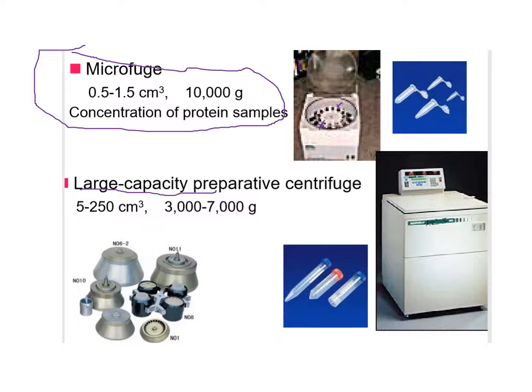This is a 1550, and there's actually 250. There's a liter. There's 5 liter. So they can be really big containers, and the rotors used are selected by what they can hold and withstand.